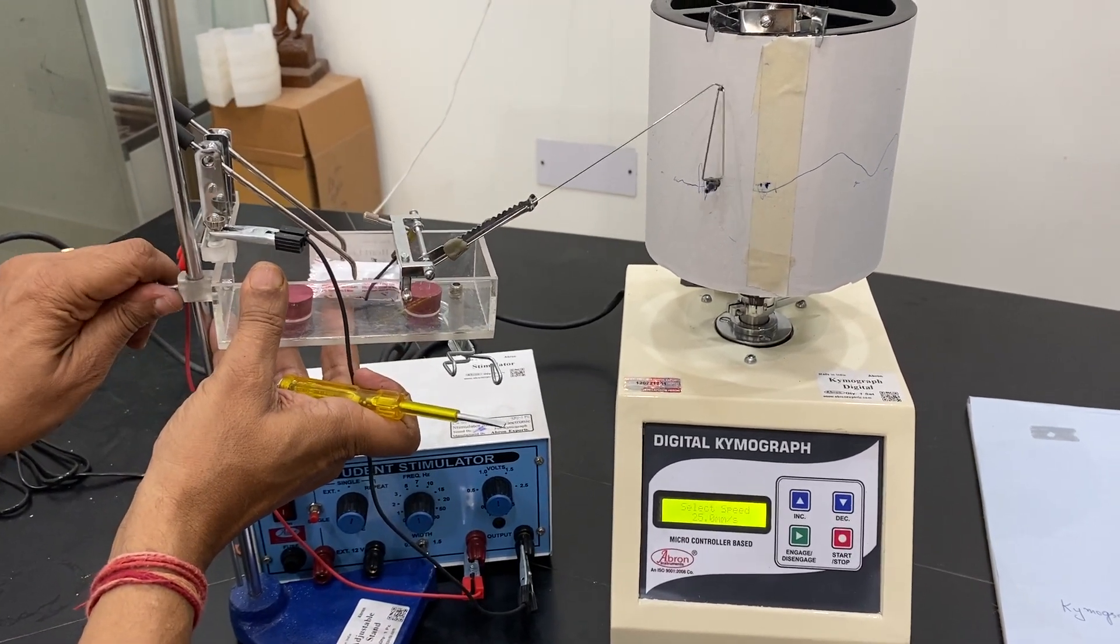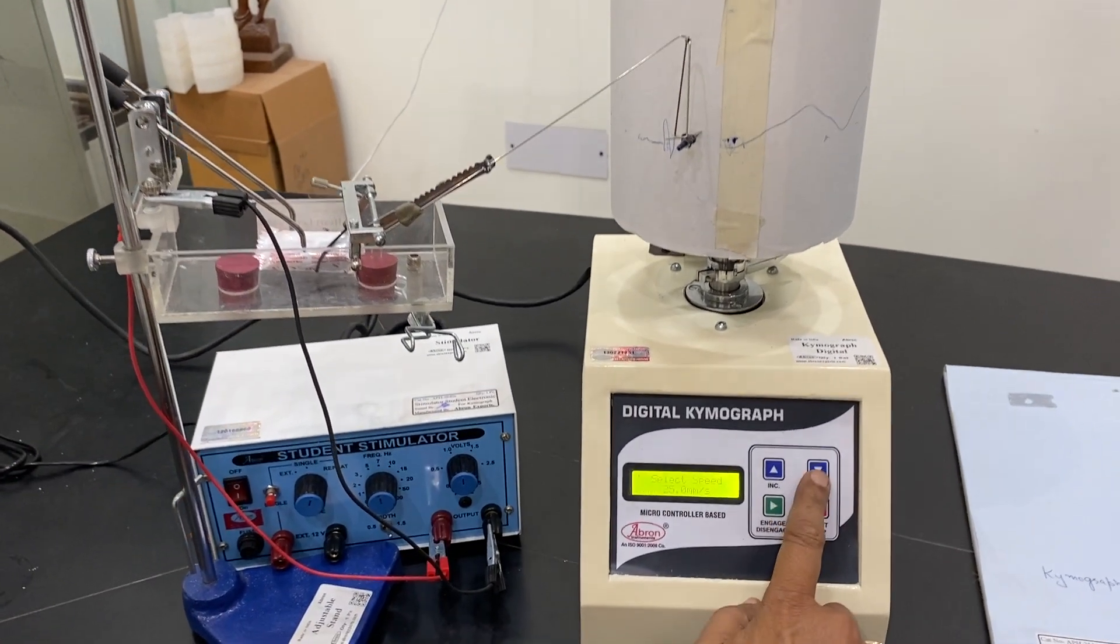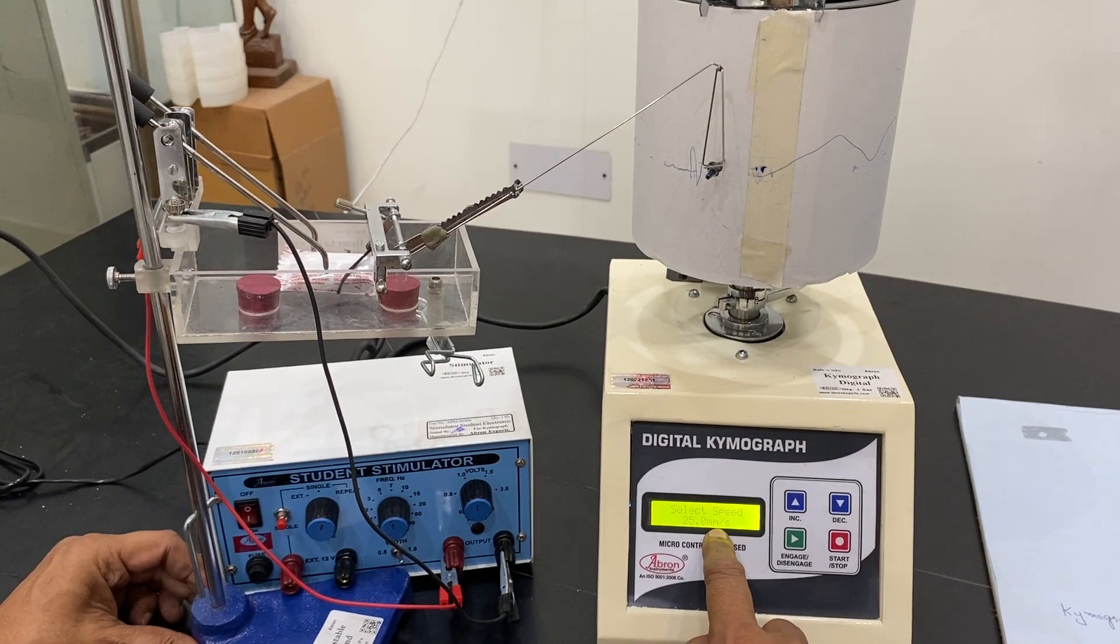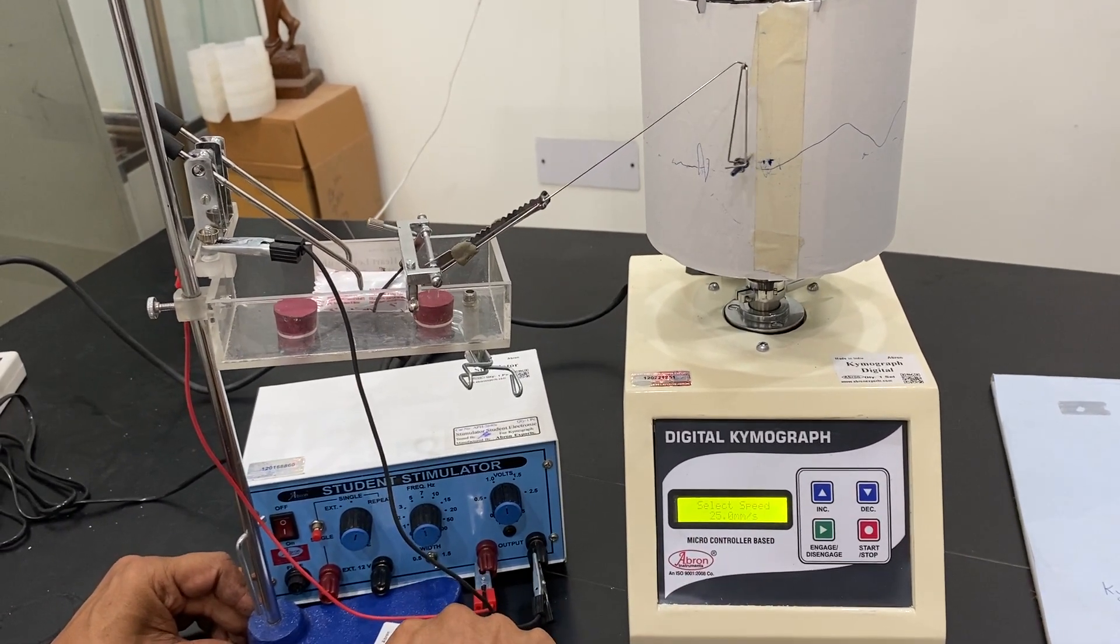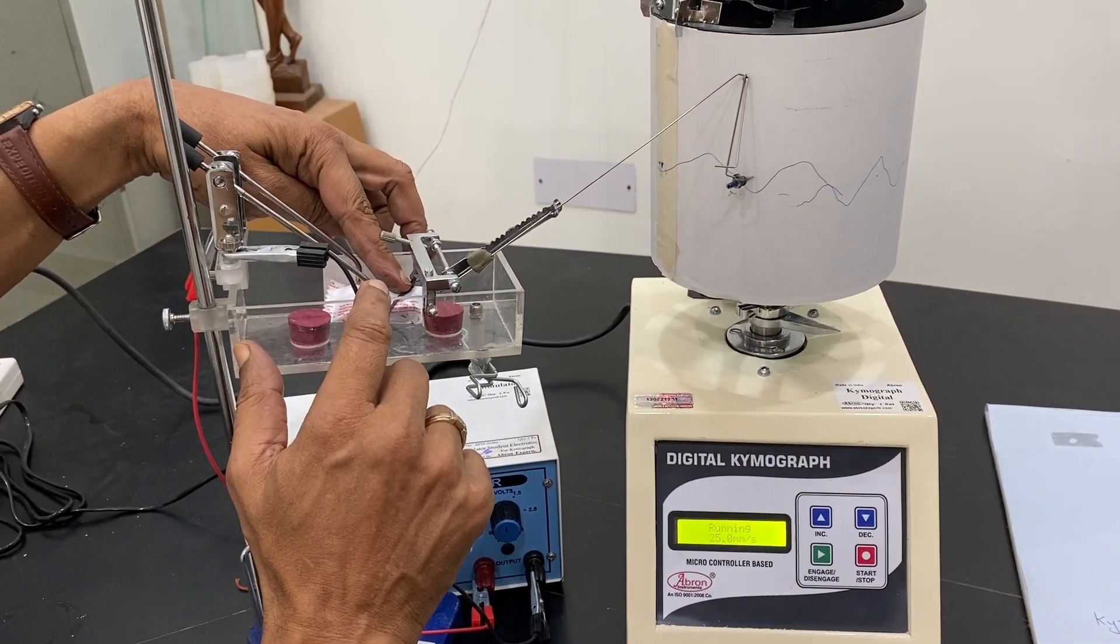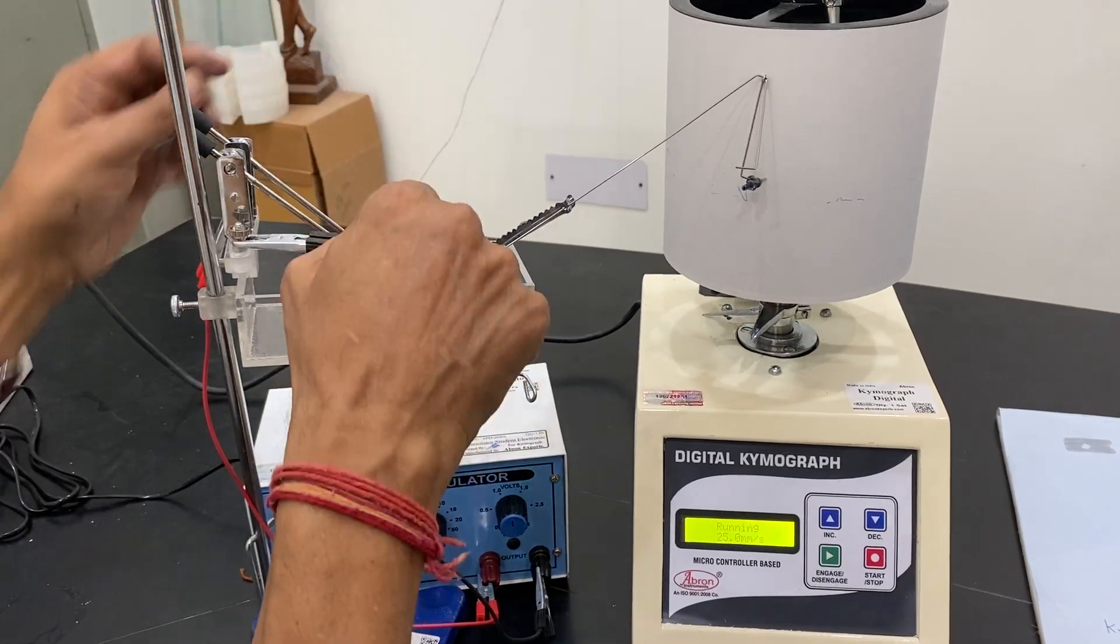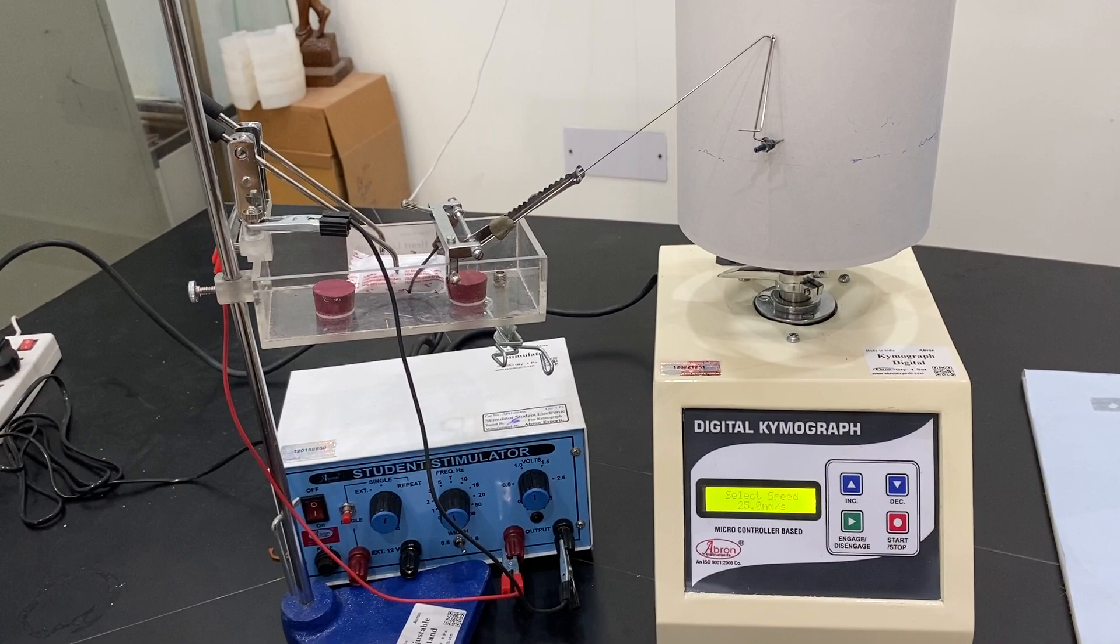Now I can select the speeds which are increaseable by digital Kymograph. I am using 25 mm per second speed. When there is a heart movement, it will move and give a graph. Then you can record by putting the chemicals, what is the reaction of the heart, and then you can stop and see.